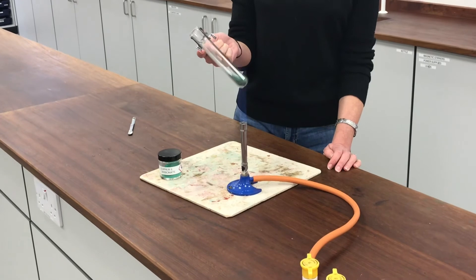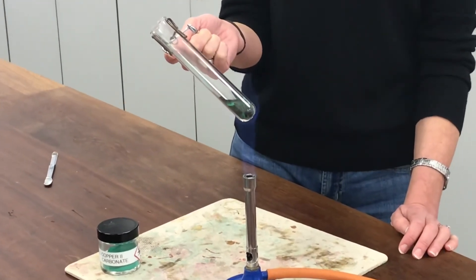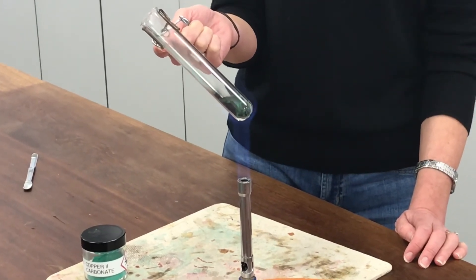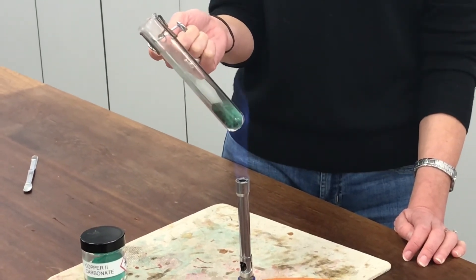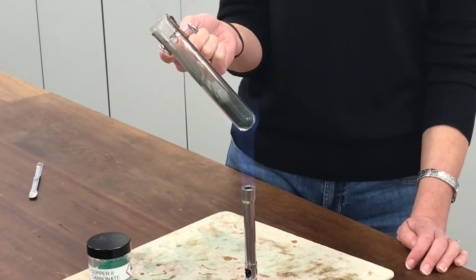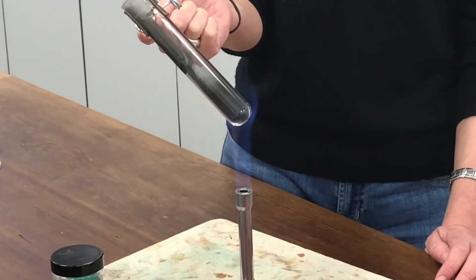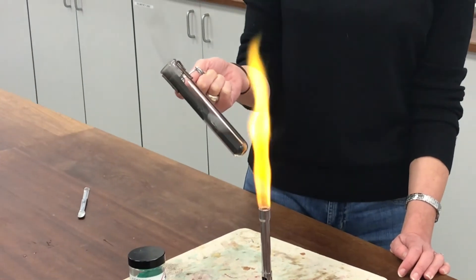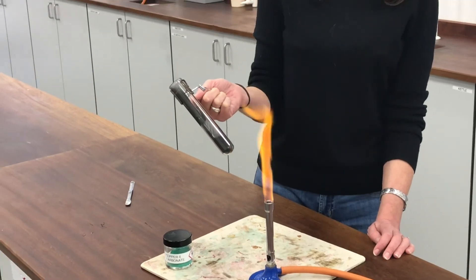My powder is starting to change colour already. What's happening inside is the copper carbonate — it looks like it changes to a liquid and boils, but it's not a liquid at all. It's dry powder flurrying around as it gets so hot. It's decomposing in there, changing to copper oxide and producing carbon dioxide. Some of the powder has got into the flame — you can see it giving a nice colour into the flame.